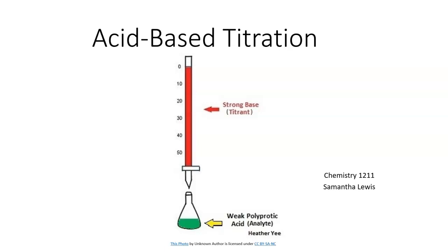I want to show you something here that we have on this first slide, your introduction slide. But notice where it says strong base, that's your titrant. Your titrant is going to be anything that's actually going to go into your burette, okay? And then, of course, your weak acid.